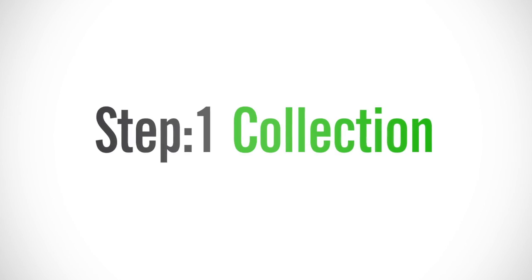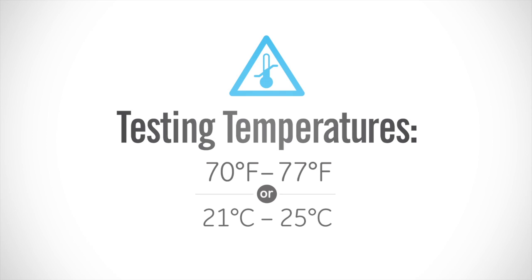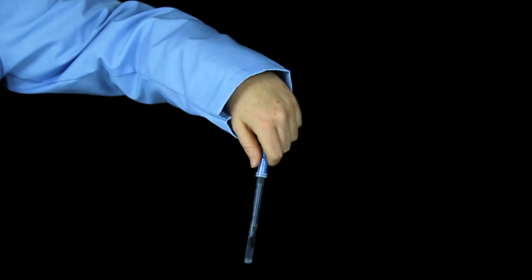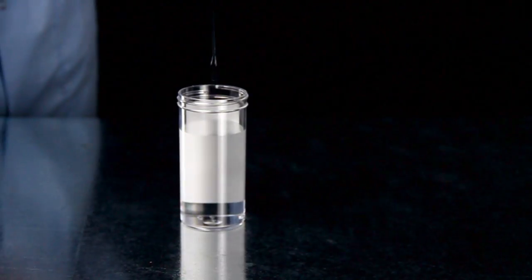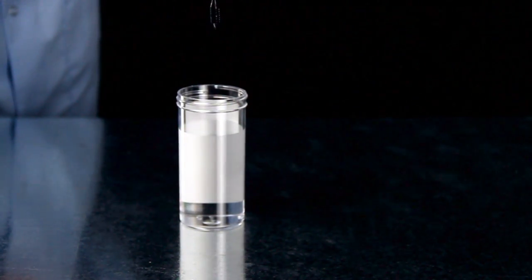Aquasnap is a three-step test. The first step is collection. Allow devices to equilibrate to room temperature before use. Shake the water sample before testing. Before opening the device, forcefully flick Aquasnap in a downward motion to release the extractant liquid from the dipper tip. Remove the dipper from the tube. Submerge the sample collection tip in the water sample for one to two seconds. Do not swirl.